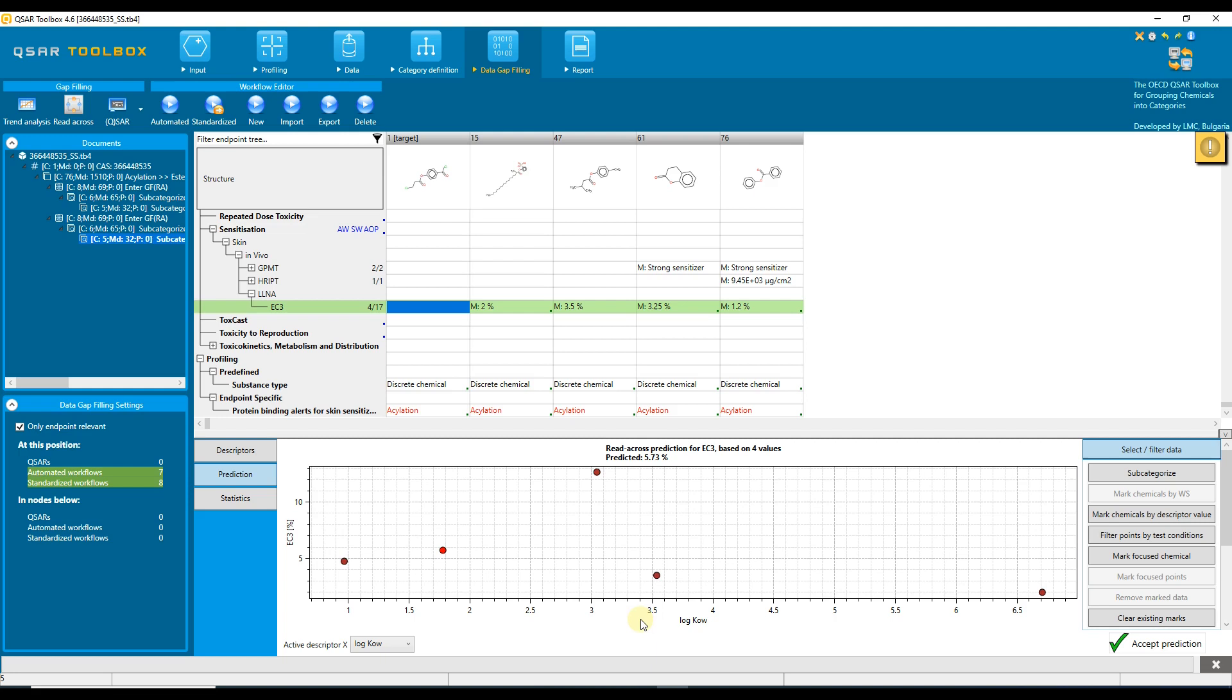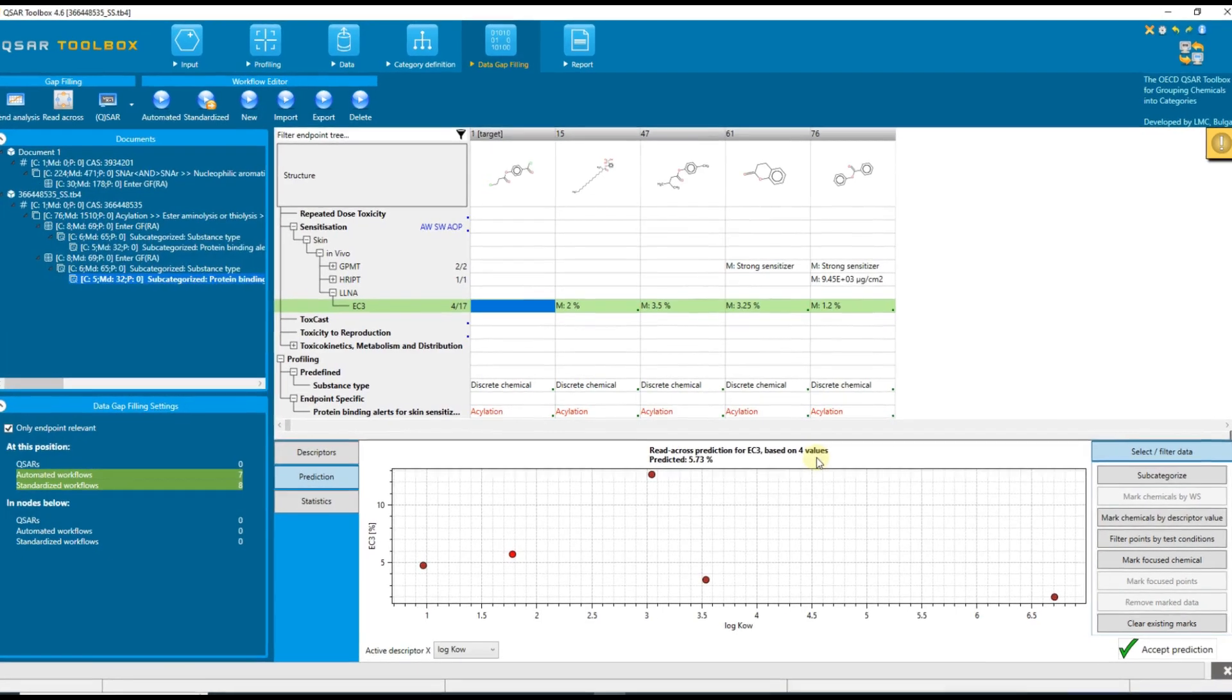The predicted EC3 value is given here in the graph heading and is based on the averaged EC3 values of the closest analogs.